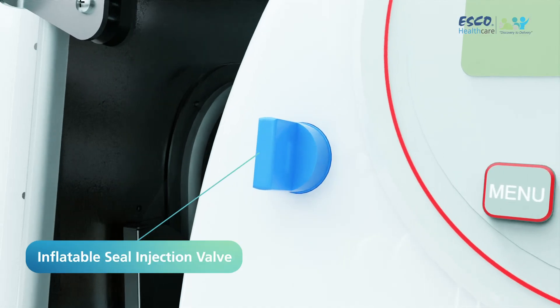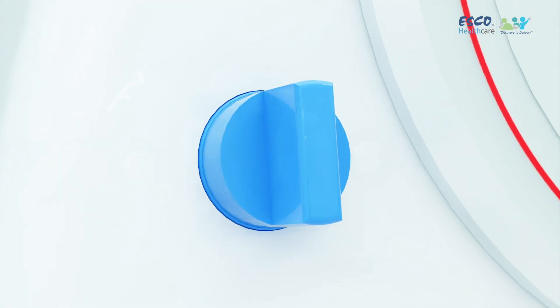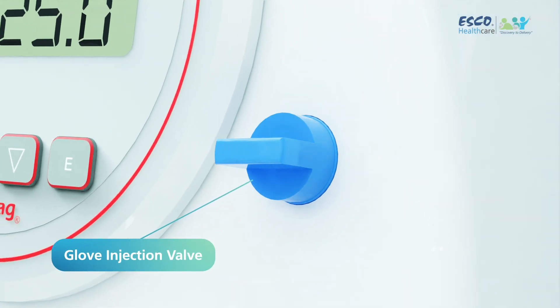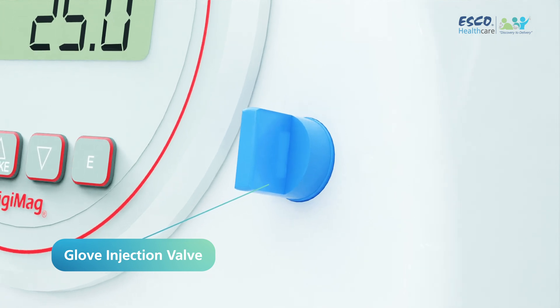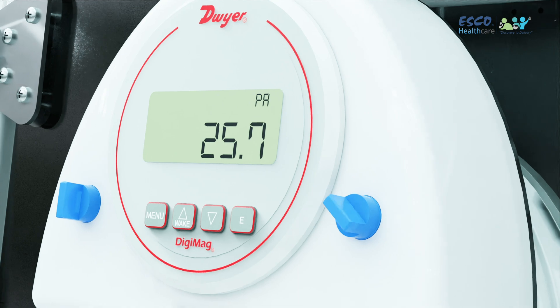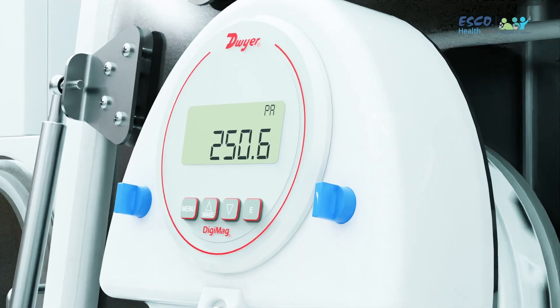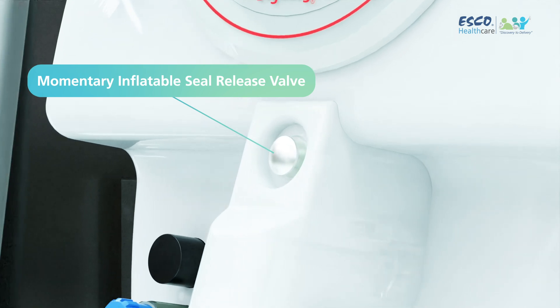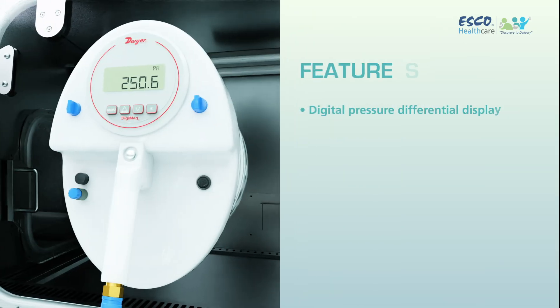Next, the inflatable seal injection valve. This intelligent design allows for a seamless and controlled testing experience. The Glove Injection Valve is right here. Tailor the testing experience to your specific needs with adjustable pressure settings. A simple press initiates the testing process, bringing your gloves to the forefront of safety. And let's not forget the momentary inflatable seal release valve — precision control over the seals, ensuring a snug fit for accurate testing.